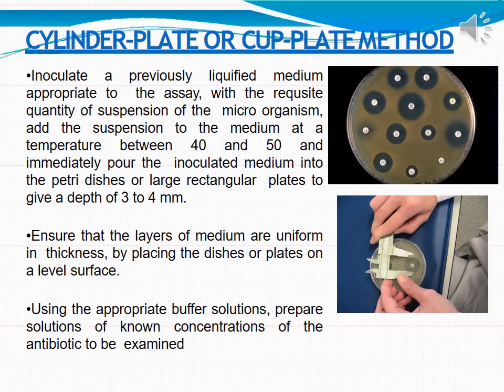This can be say 0.1 ml or even 0.5 ml, not more than that. That dilution you need to calculate according to the concentration of microorganisms in the stock solution. Now to this conical flask you add the microorganisms, you stir it, and you pour this liquid nutrient agar into your already sterilized petri dish. You allow the petri dish to cool down so that the nutrient agar gets solidified. So what you have basically done is you have used a pour plate technique.